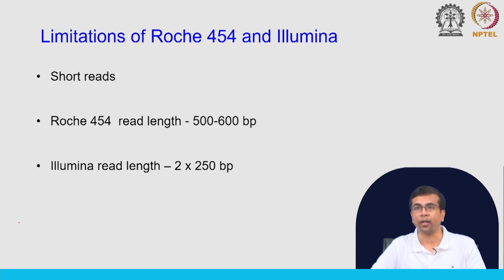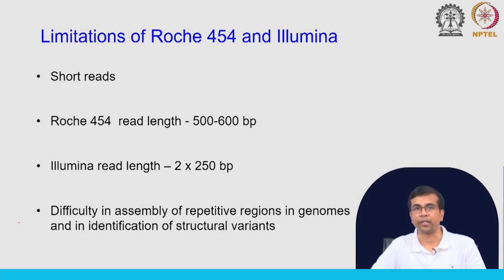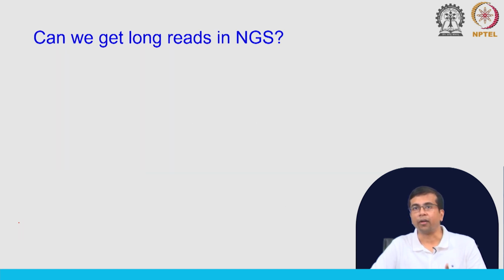That is something that would be very helpful for genome assembly. So, as I said, there is difficulty in assembly of repetitive regions in genomes and identification of structural variants with these very small reads. So, can we get long reads in NGS?